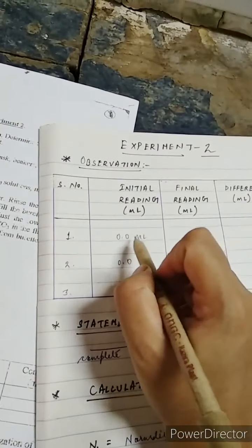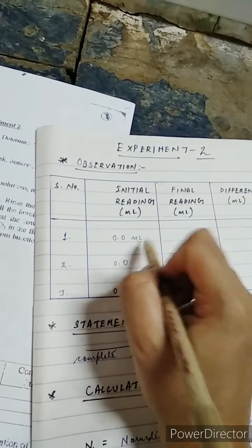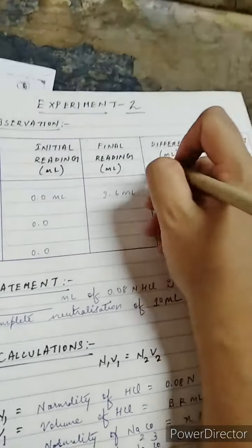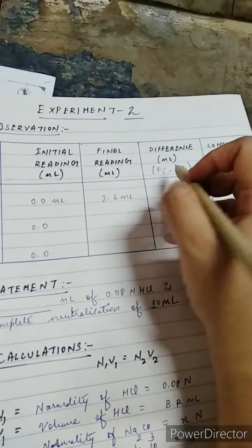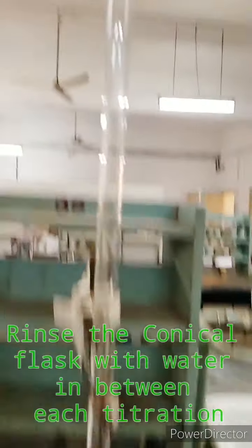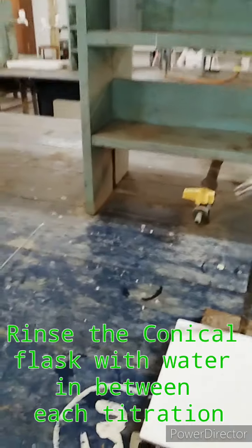Let us note our readings here. Our initial reading was 0.0 ml. Our final reading is 9.6 ml. So our difference, final minus initial, is 9.6 ml. Now for the next titration, we will again clean our conical flask with water.